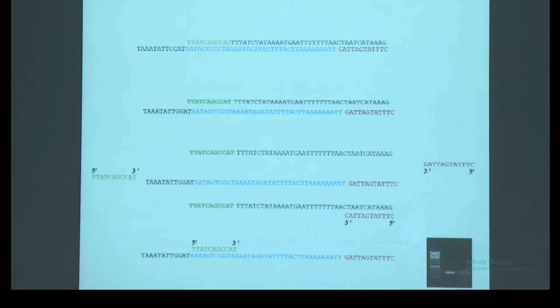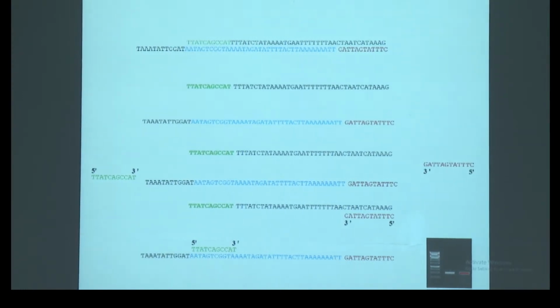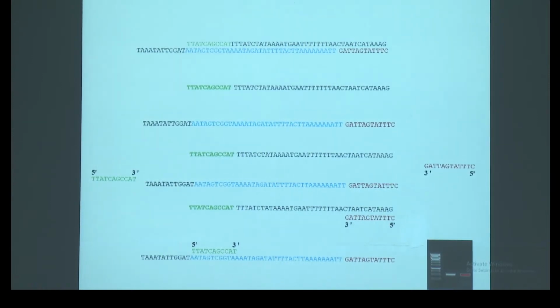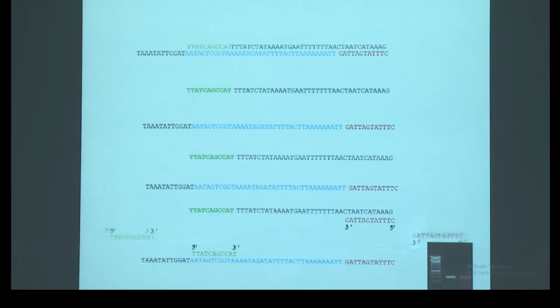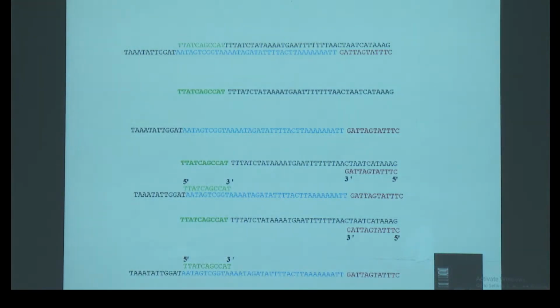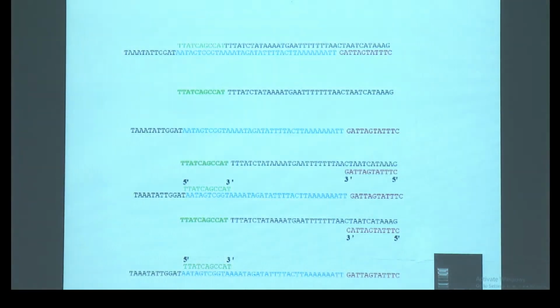So each product will go like this. Now the product synthesized last time, when we denature it, this is the specific product we are expecting, right? So in normal PCR this happens and we keep on going for 35 cycles, and in each cycle the PCR product gets doubled, and at the end we see a specific product on the gel, right? That is measured based on the size of the ladder, right? Then how are you sure this is 100% our desired product? Are you sure 100%? We are not sure still, right?